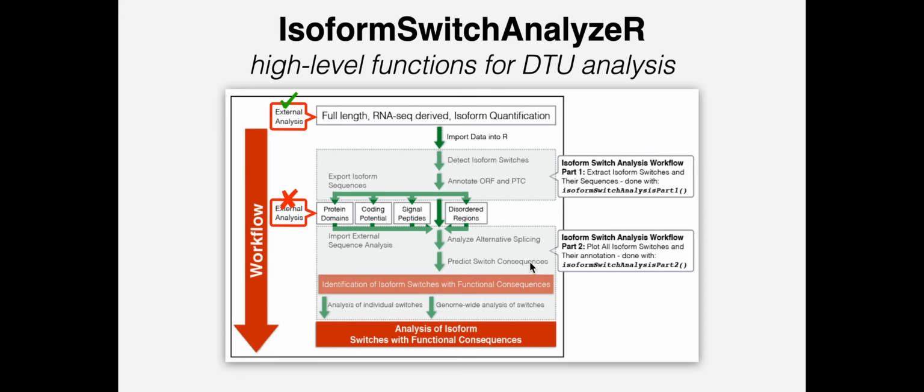And so that whole process can actually be bundled together in a single function, which is why we're going to do this in the course. Are there other ways to annotate and think about isoform switching? Yes, but no other ones that I know of that can be so easily integrated with our existing workflow. And I will say the work done to put this R package together and to document it is just fantastic. So it really is a powerful approach.